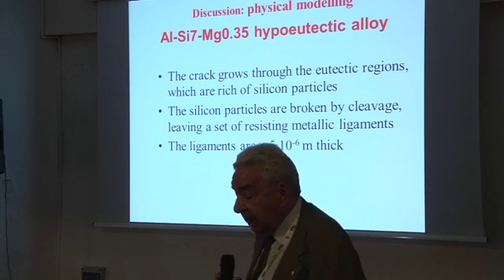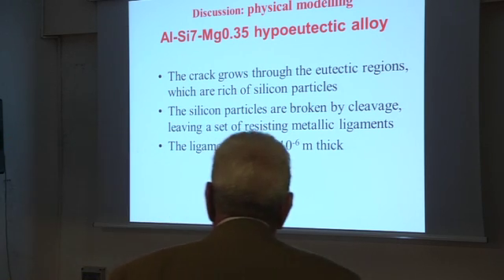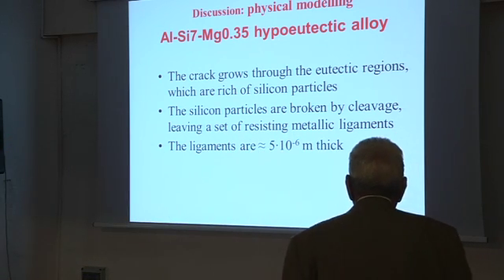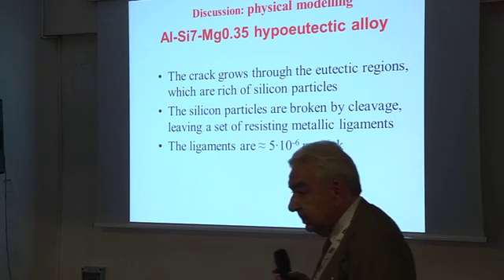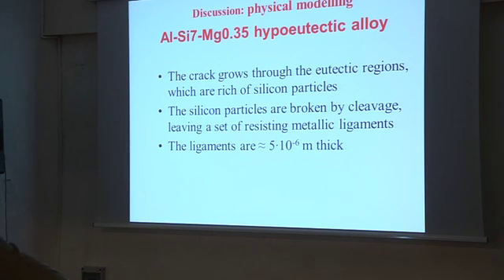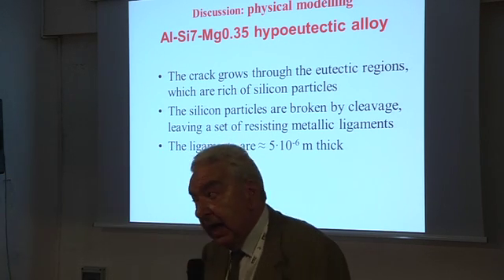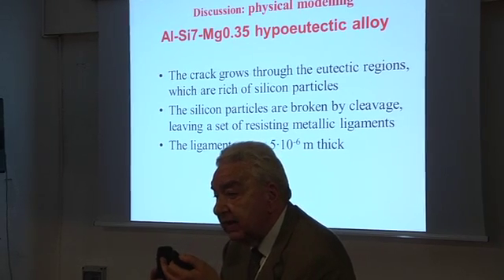The ligaments are 5 × 10⁻⁶ meter thick. The silicon particles are broken by cleavage, leaving a set of resisting metallic ligaments. Again, it is the metal that withstands the strain in front of the advancing tip.